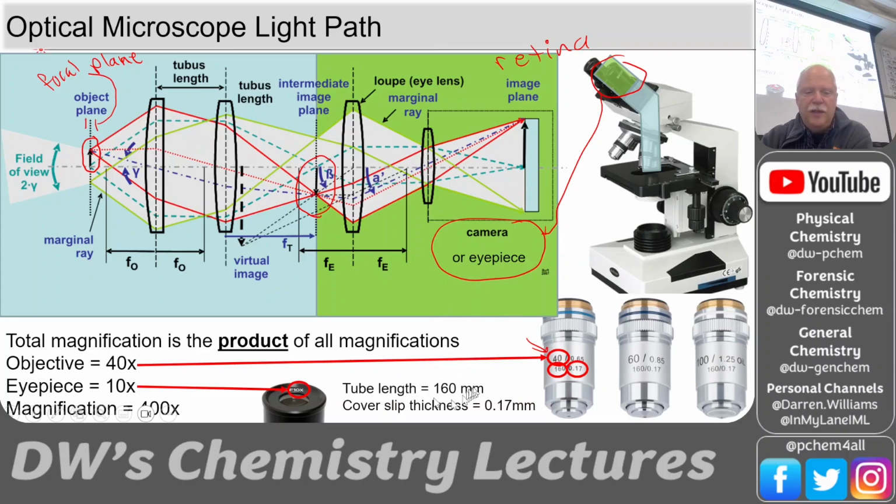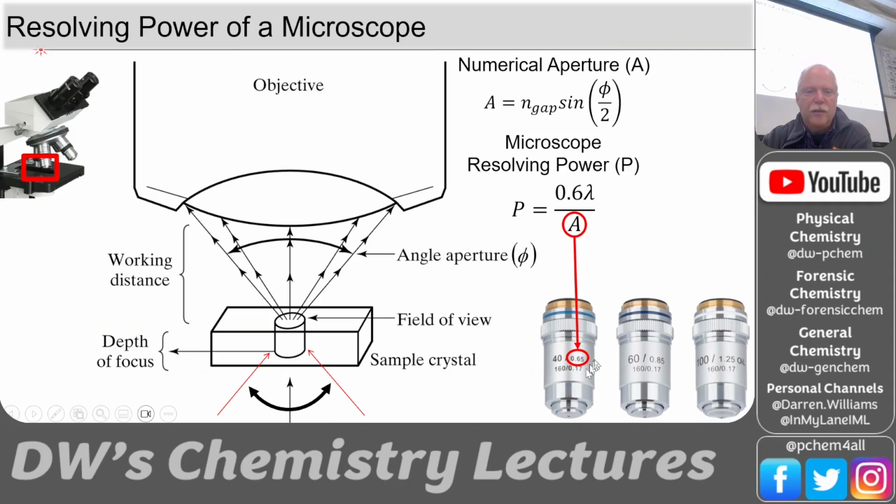And then you also have these tube lengths that this is made for. This objective is made for 160 millimeter tube length and a cover slip thickness of 0.17 millimeters. Now, one thing that's super important is whether these objectives are made for air or for oil.